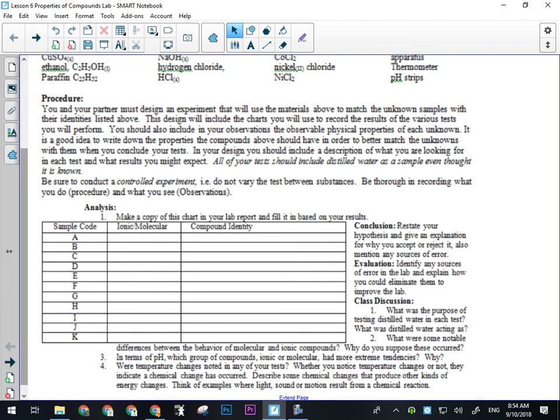I'm really going to spoon feed you this first lab. Don't expect it like this every time. But this is your first high school lab, so here you go, open wide. I'm going to spoon feed you on this one. So our manipulated variable here is the unknown substances. You need to explain why. And we kind of already said that. So if you listen to this while you're doing your lab report, you'll probably get it. Or if you were listening closely right now, which is even better.